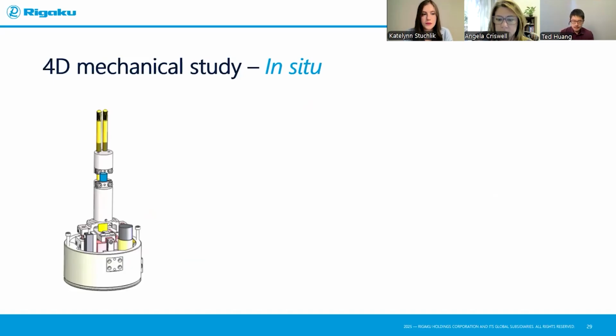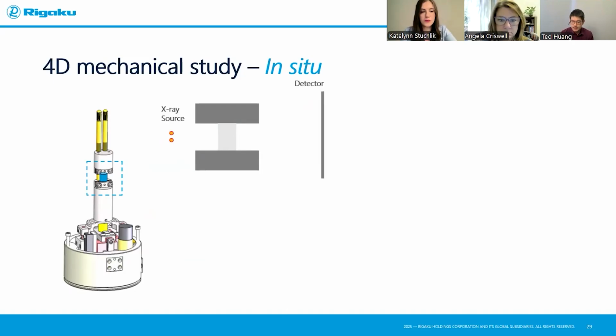But before that, let's dial in a bit. Let's look at a bit more about the details of the challenges I talked about that pertain to the stage that you want to use. And it's actually the challenge I faced when I was doing this experiment. So I put the cylinder inside the jig and I want to scan it. So this is an indication of my cylinder of meteorite in between the compression stage. And then I scan it using X-ray CT. So I shine the X-ray source, both top and bottom, stitch them together, get the X-ray through to the detector.